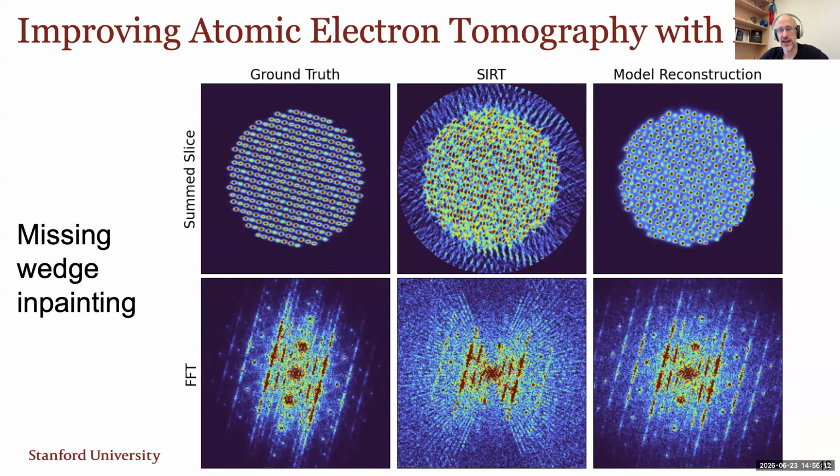However, I want to caution you, and I do have slides on this, but in the interest of time, I'm not going to pull them up. If you're learning diffraction patterns in 3D, you should be aware that you're still not learning the phase of each of those spots. So you can in-paint the missing intensity spots, make a prediction for it, but not the phase. And so that's why I think for learning 3D diffraction patterns, what you really want to do is do it in combination with a phasing algorithm.